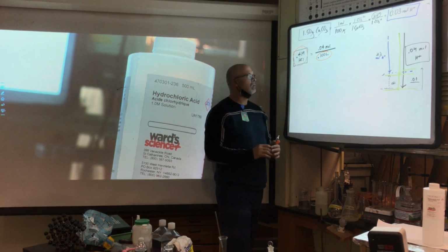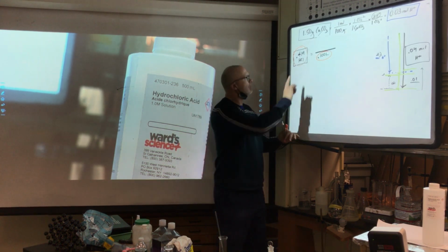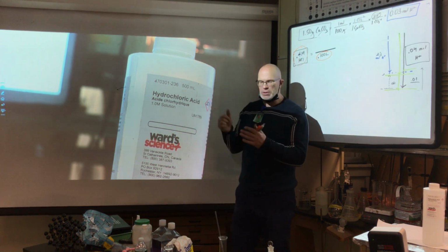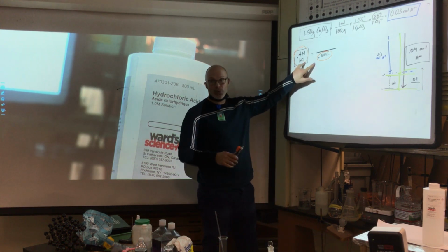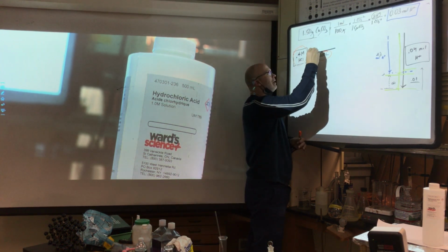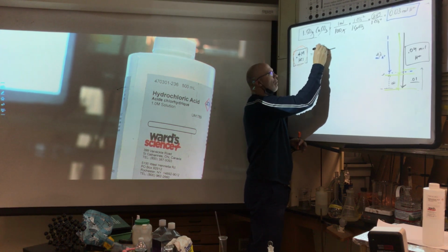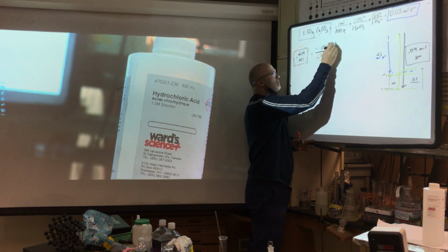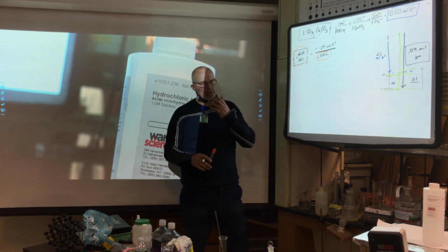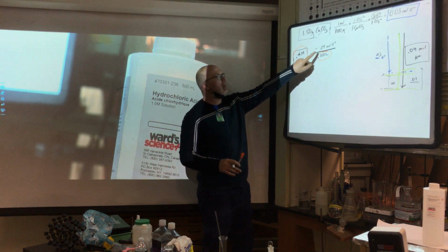But if I was doing this without the lab, and I said, I want to make 100 milliliters, which is 0.100 liters, of the 0.4 molar from this, the first thing I would do is find out how many moles of H+ we need. Because we already had it up here, you solve for your moles, and you're going to get 0.04 moles of H+. Great. So the first thing I do is figure out how many moles are in my solution. Mr. Grazzi, could you make for me 100 milliliters of a 0.4 molar solution? Great. Once I have those pieces of information, I solve for moles.